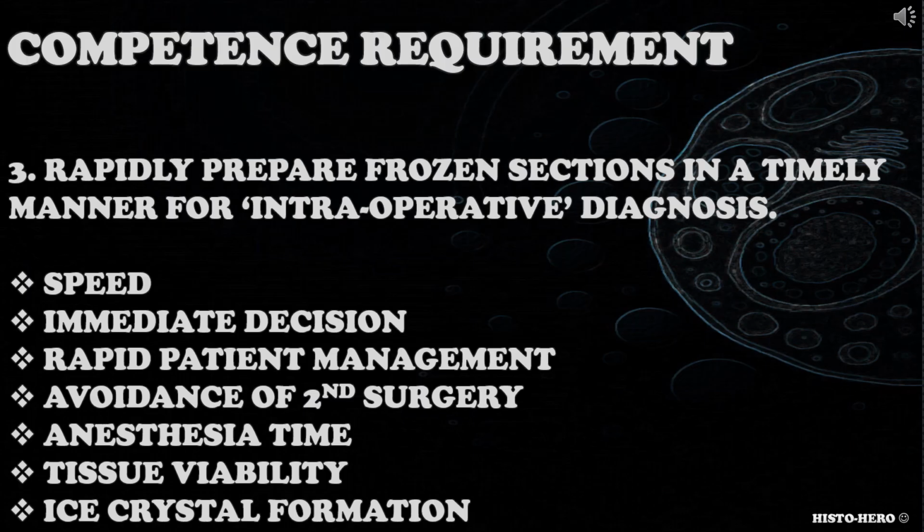When addressing this competence requirement, candidate could consider speed, immediate surgical decision, rapid patient management, avoidance of second surgery, minimizing anesthesia time, maintaining tissue viability as it is not fixed, and ice crystal formation.